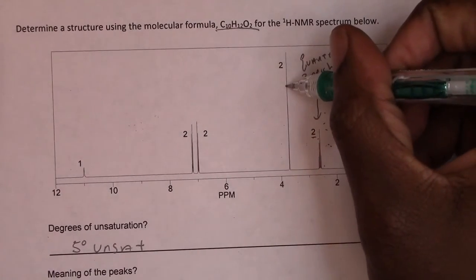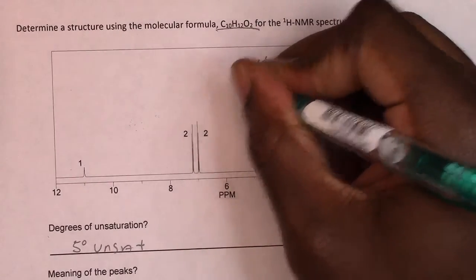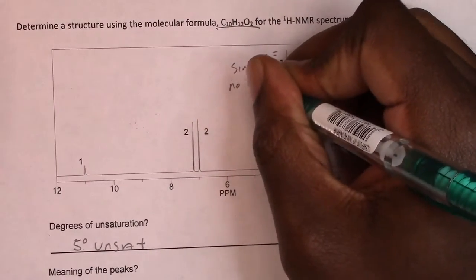Now moving forward, we have a singlet, which means that there are no neighbors.